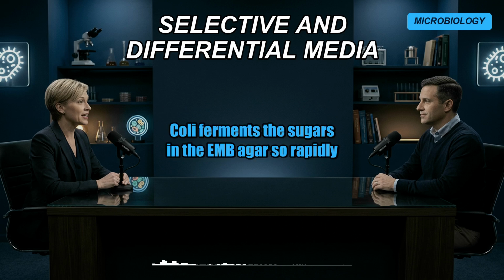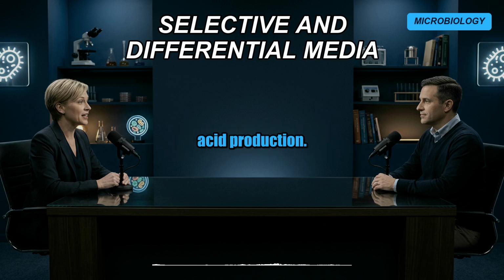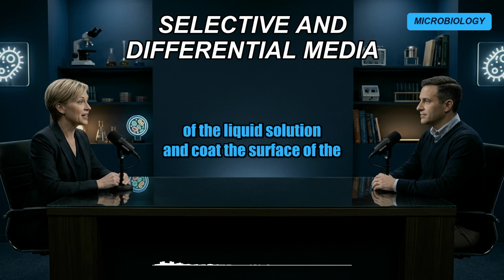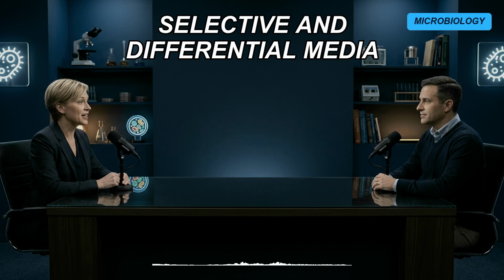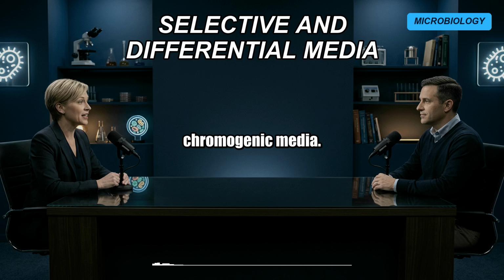The E. coli ferments the sugars in the EMB agar so rapidly and aggressively that it creates a massive localized spike in acid production. Oh. That sudden drop in pH causes the specific chemical dyes dissolved in the agar to physically precipitate. They crystallize out of the liquid solution and coat the surface of the colony, reflecting light to create that metallic green sheen. Which perfectly transitions to the modern frontier of differentiation, a technology that feels like absolute magic, chromogenic media.